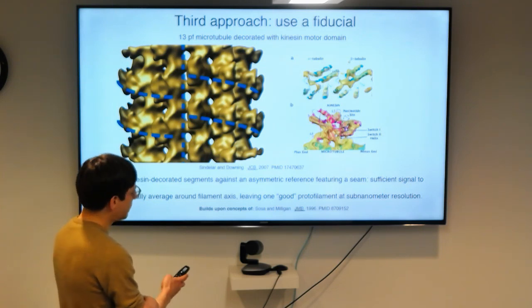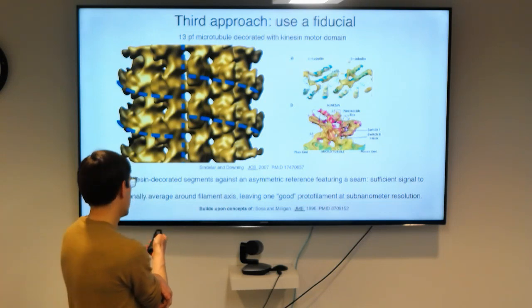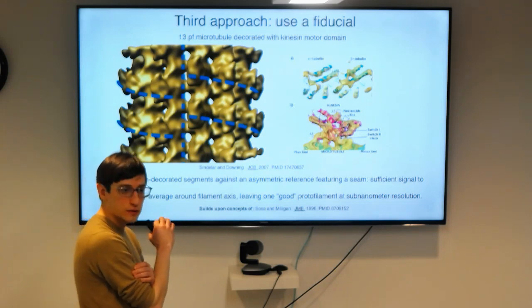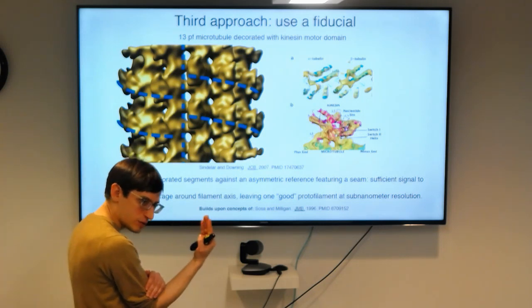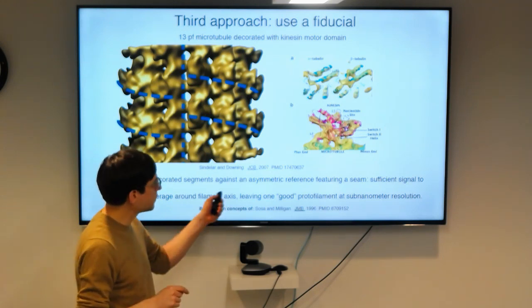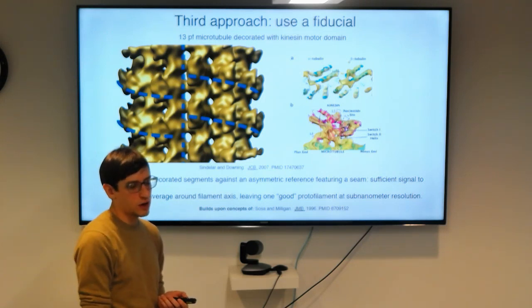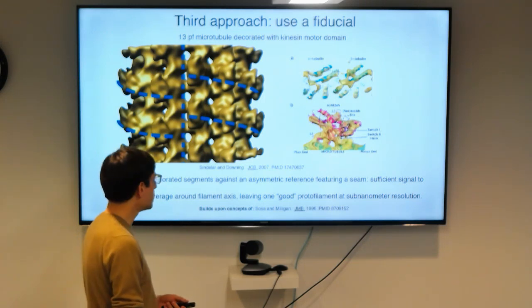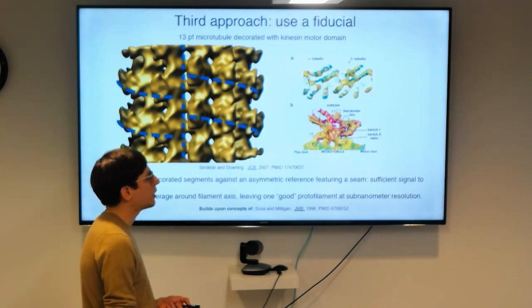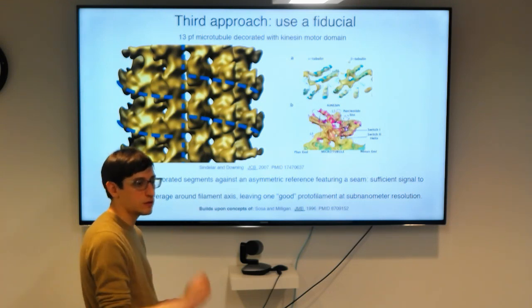So you can actually tell them apart in this map. So you actually don't need one that specifically recognizes alpha and beta. They do have differences. There's actually a prominent loop on the inner surface of the microtubule that I'm not showing that is way longer in alpha than beta. So even at this resolution, at 8 angstroms, you can tell them apart and actually tell if you've gotten the solution right. I actually don't know, off the top of my head, of a protein that only binds one or the other. Most bind an interface between them, different interfaces between them.